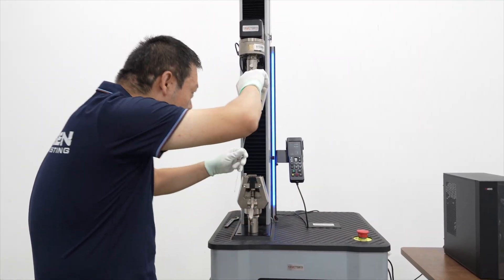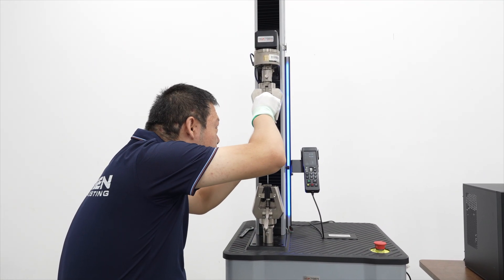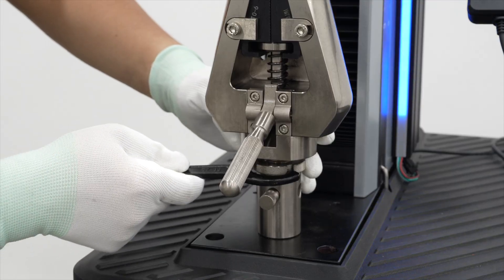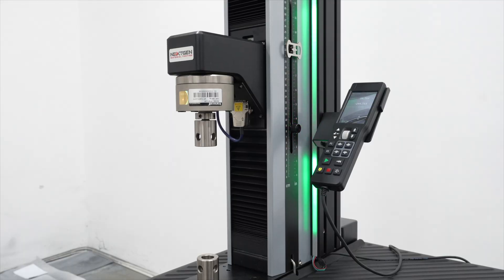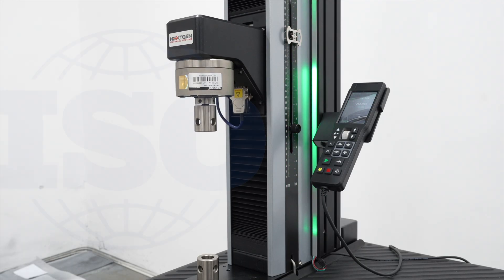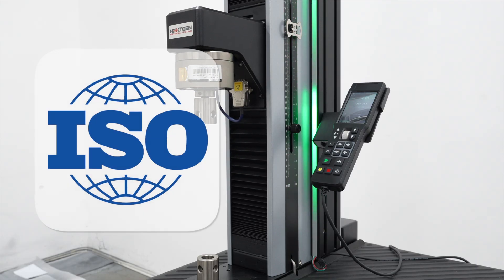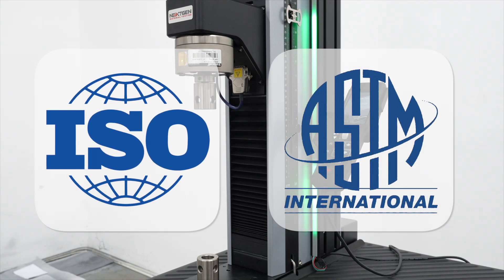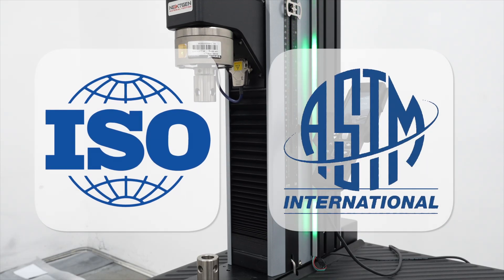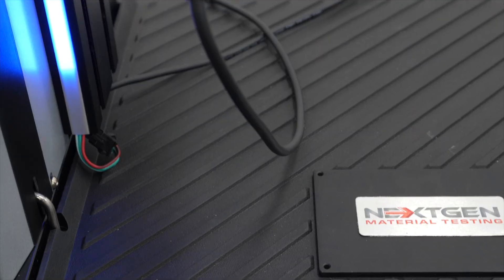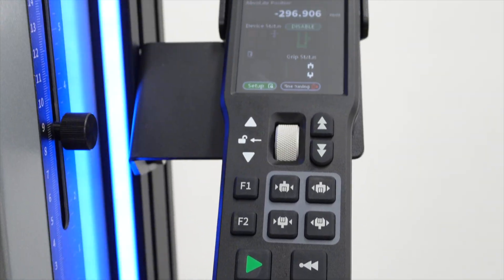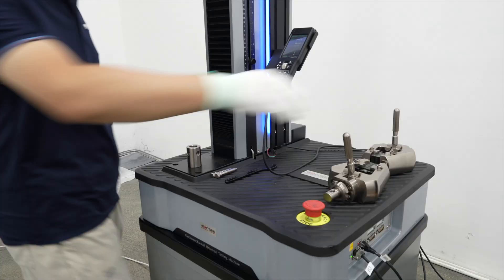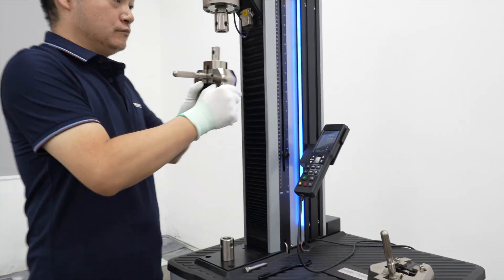Direct drive servo system delivering high stiffness, fast response, and perfect position accuracy with strict compliance to industry standards including ISO, DIN, and ASTM. Features precision load cells, high-resolution encoder, and quick-change grip fixtures for versatile testing.